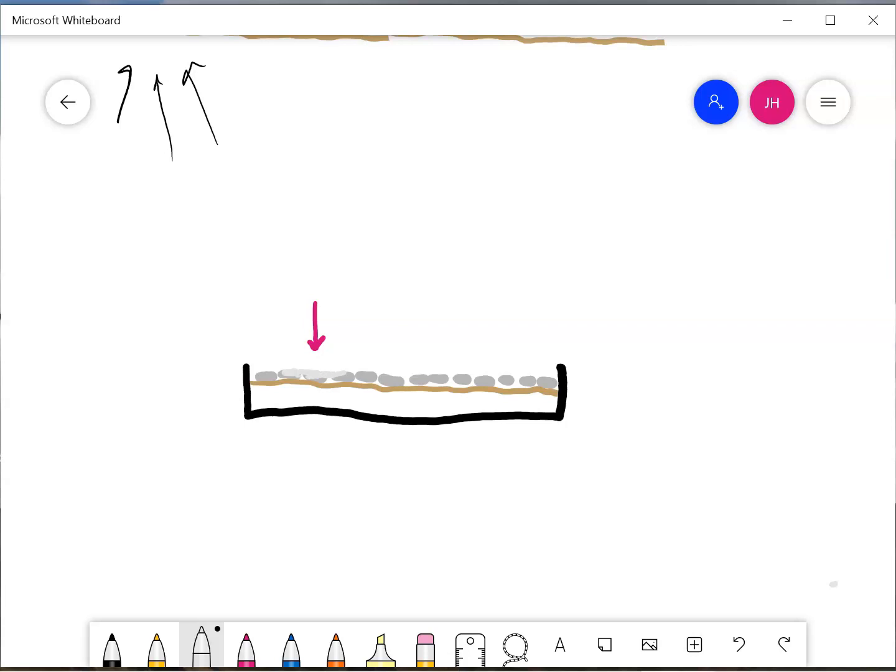And so what we see is a lighter area on the petri dish where the host cells have died and broken open. So it just becomes a clear area where we can basically see through the cells. And so the same thing would happen over here. If we put another virion down, we'd get another area of dead host cells where they're breaking open.